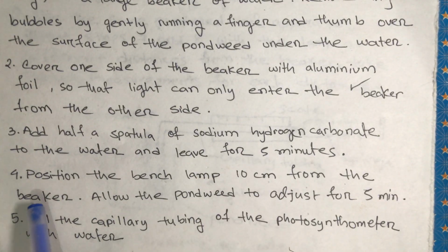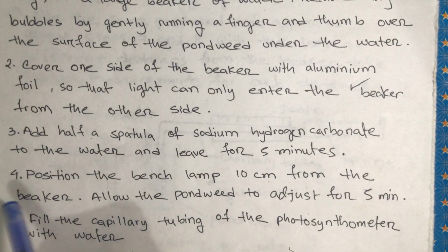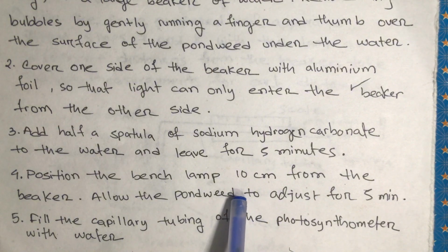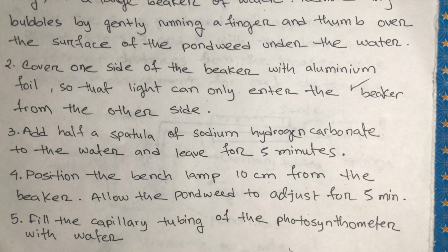Okay. Position the bench lamp 10 centimeters from the beaker. Allow the pondweed to adjust for 5 minutes. Okay, this is the procedure, and to gain a complete mark, you need to write exactly the experiment, like all the details, all the instruments you use in it. Even the little details are important for Unit-6, to be honest, to gain a complete mark.